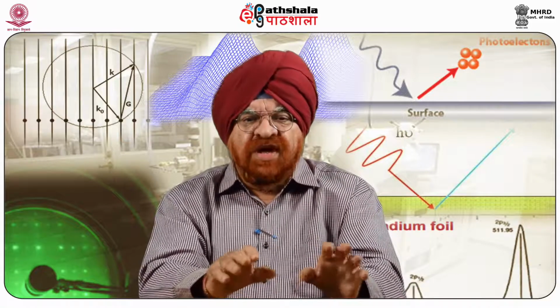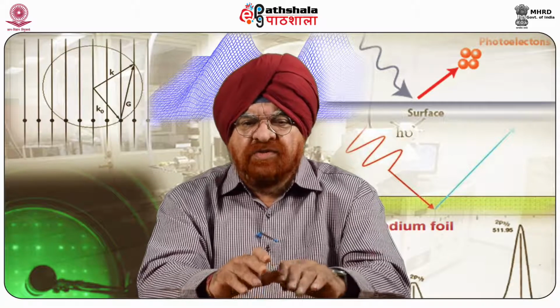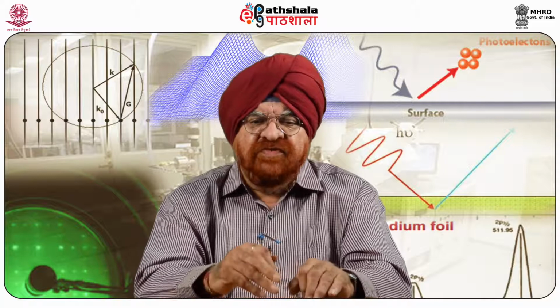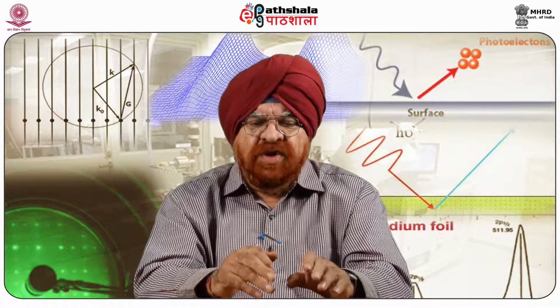The materials under investigation include thin and thick film coatings, ceramics, composites, glasses, synthetic and biological membranes, metals, polymers, and semiconductors. The AFM can examine any rigid surface, either in air or with the specimen immersed in a liquid. Minor and major differences between smooth surfaces and rough surfaces are shown dramatically.